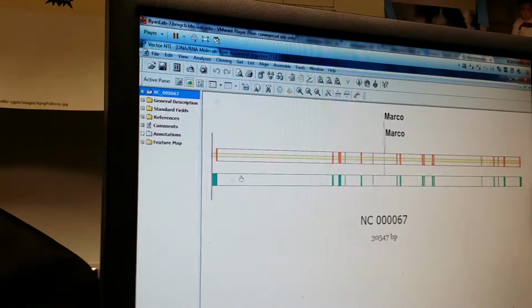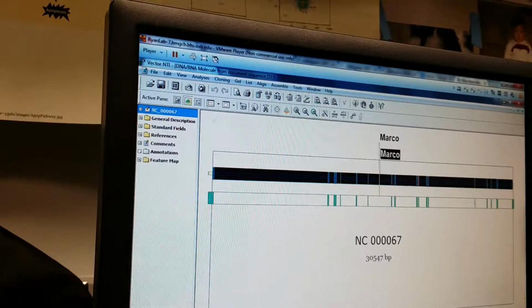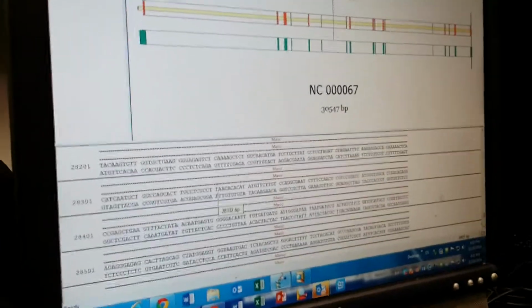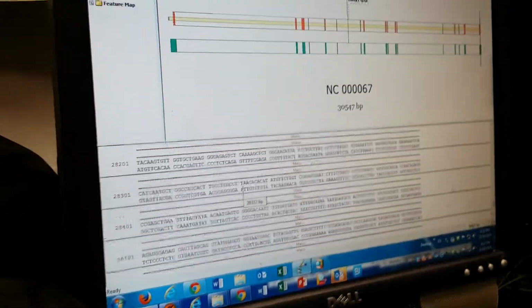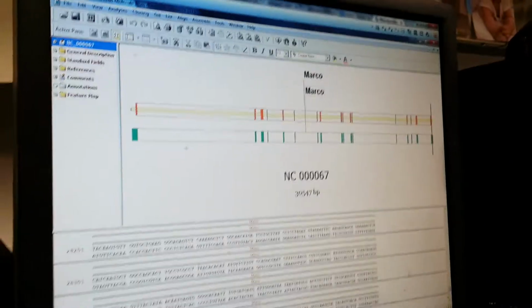So that's the gene. This is an exon. It depends on where you want to target. You want to knock out which exon, so we can find the potential sequence. Yeah, this is the sequence. Something that would knock out the frame, make it out of frame if it was gone. Knock out one exon, let's just say. I can knock out the whole sequence, the whole gene. With CRISPR or without CRISPR? Probably without CRISPR, the efficiency is probably a lot higher.